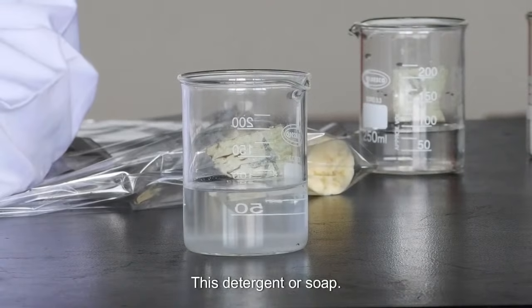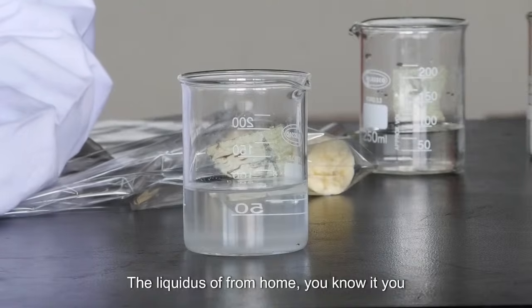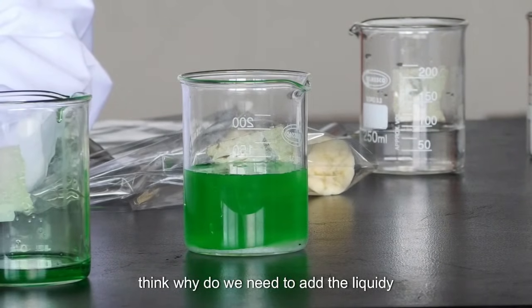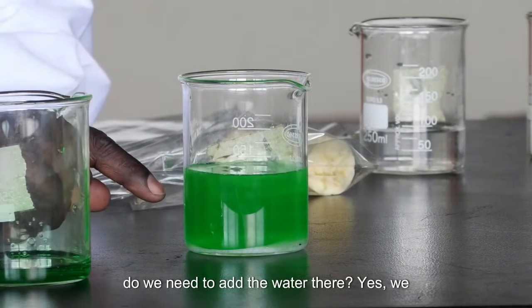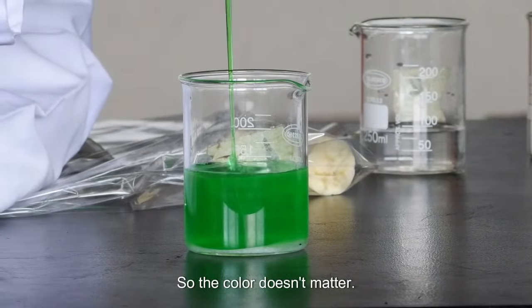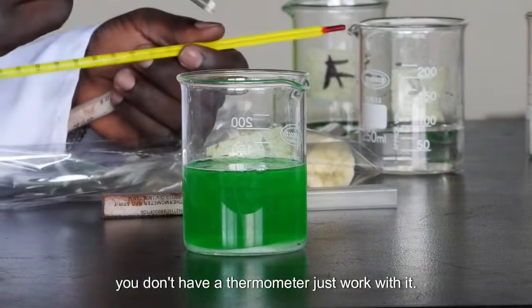Then now I have to add this detergent or soap, the liquid soap from home. Think, why do we need to add the liquid soap? Why do we need to add the salt? Why do we need to add the water there? We have to see each and everything. The color doesn't matter. You need to keep the temperature low. If you don't have a thermometer, just work with it.